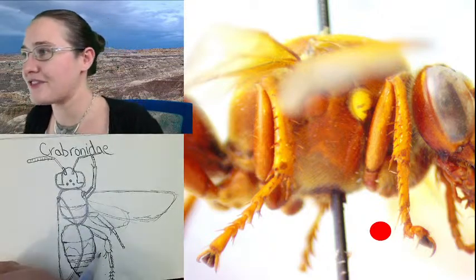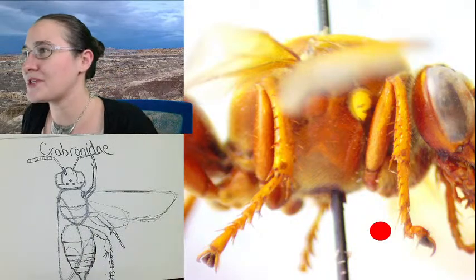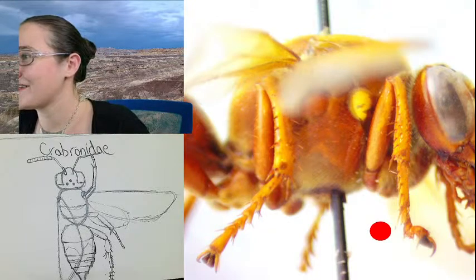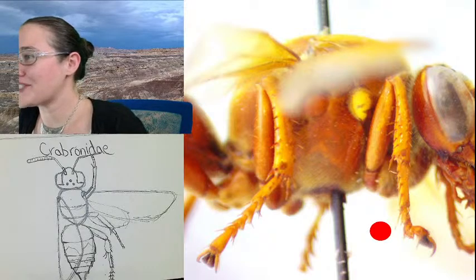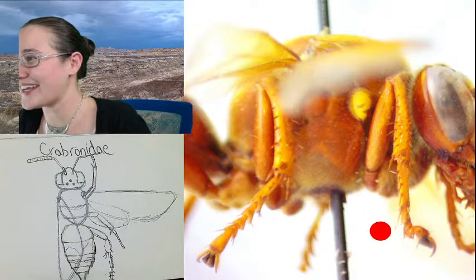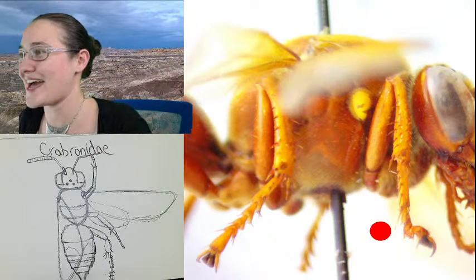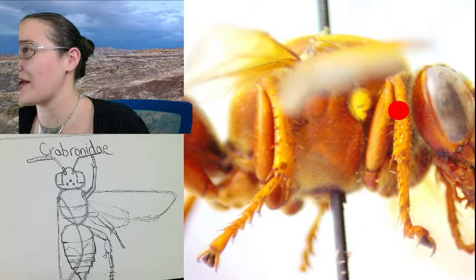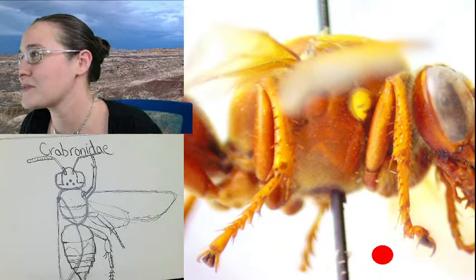All right, so we have the legs, we have the wings, we got that taken care of. I'm going to look up a cheat sheet really quick. Don't mind me. I have all of my cheat sheets back from college, and it gives me all of the characteristics I use to ID these guys. I think that what we're looking at right here is characteristic for the family, but I wanted to look it up before I confirmed that with you.